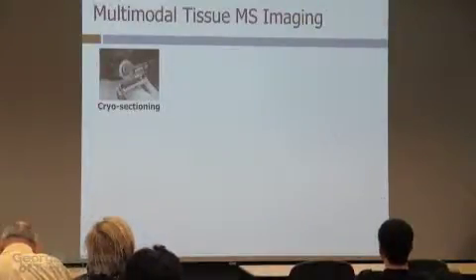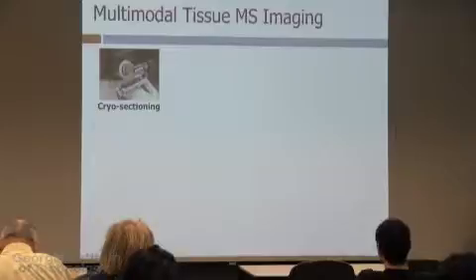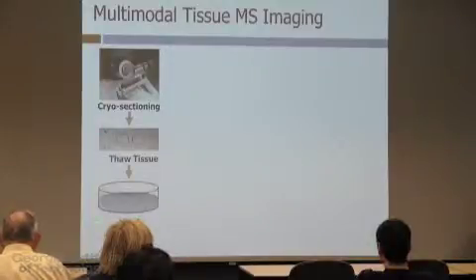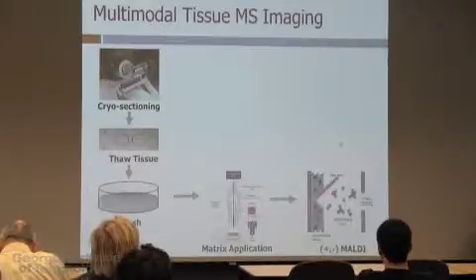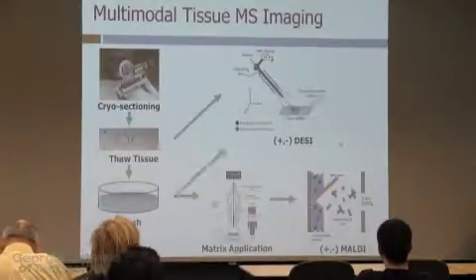So let me just show you results. We typically apply several techniques. We take a tissue sample. We use the histology core here to take a slice of that tissue sample with a cryomicrotome. We put it on microscope slides. We thaw it in a desiccator. Sometimes we wash it, depending on what we're looking for. Then if we're going to do MALDI, we use the IBB core facilities here. They've developed a system to deposit the MALDI matrix, and we use the MALDI instrument in the facility to image by MALDI. But we also do DESI in our labs, and DESI doesn't require the matrix. It works a little bit differently. So we are going to have two sets of images.